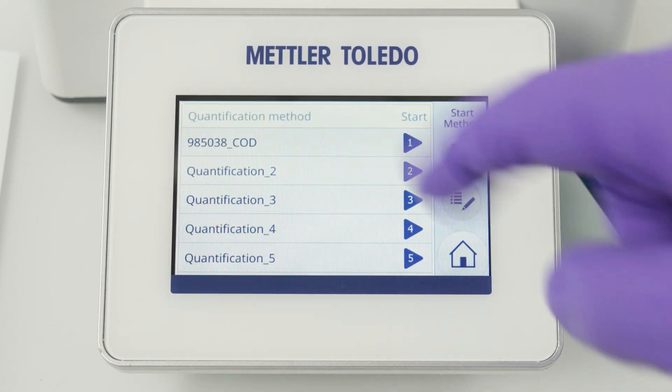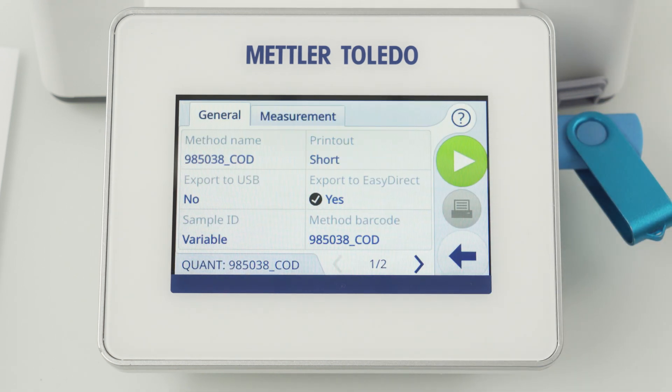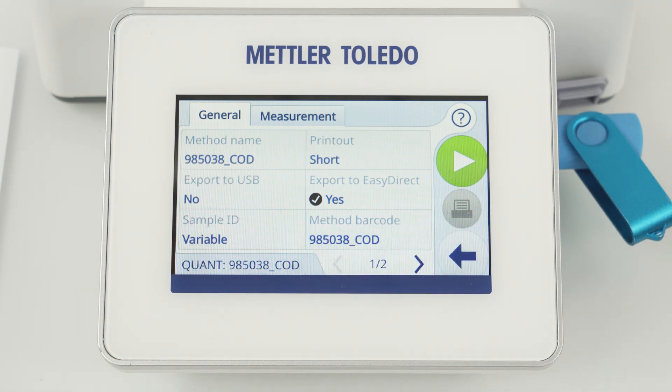In order to facilitate the workflow, each method comes with a predefined barcode for the ScanStart functionality. ScanStart enables you to start a method by scanning a barcode instead of selecting the method from the list. Furthermore, the barcode reader can be utilized for the input of the sample ID.